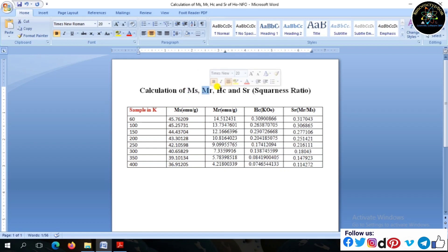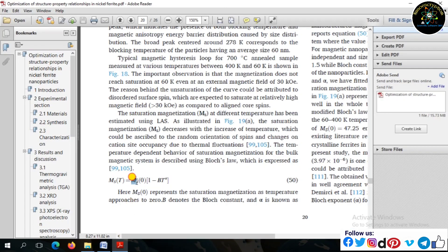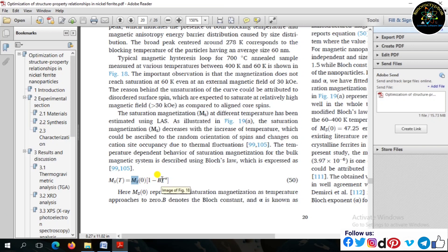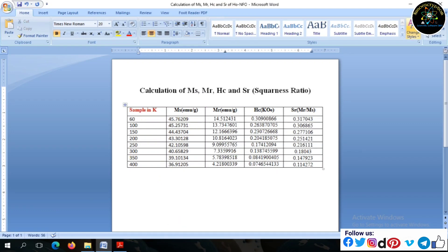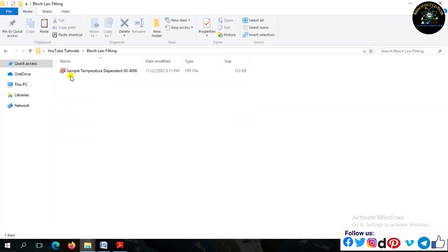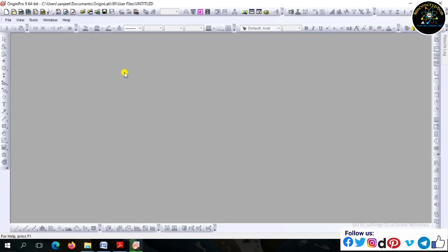First, extract the saturation magnetization points from the temperature-dependent MH loops. This is the temperature-dependence MH loops of magnetic data.